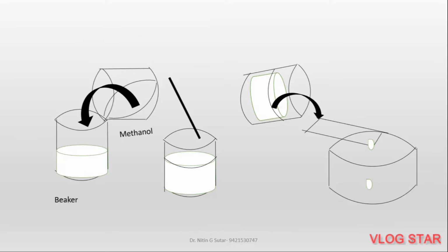Because this is the heart of the chromatography. Just as for the foundation of a house, the base is important, like that, the preparation of the slide is also important for the chromatography. So spread the solution on a slide, and just like that, the slide is prepared.